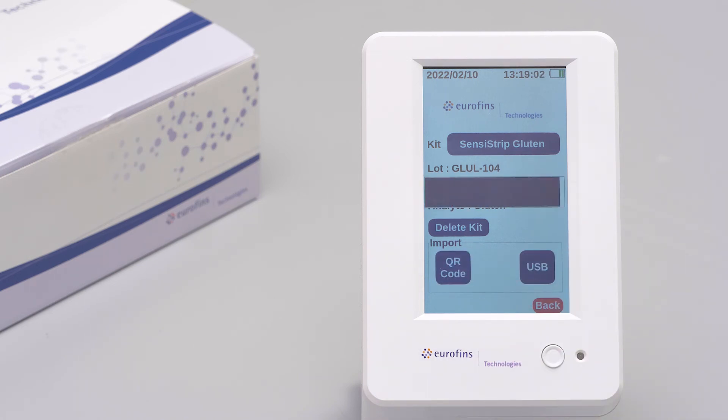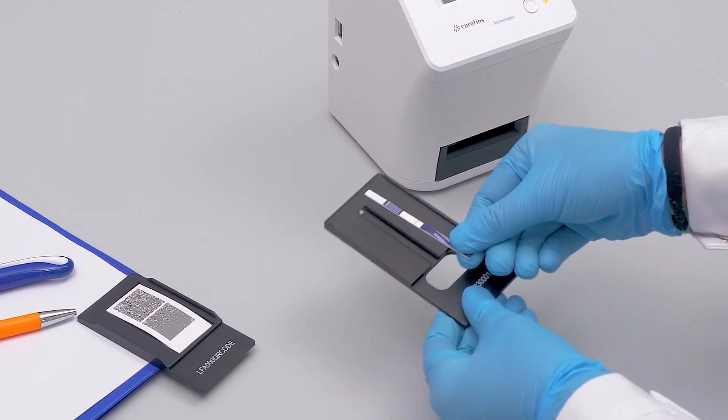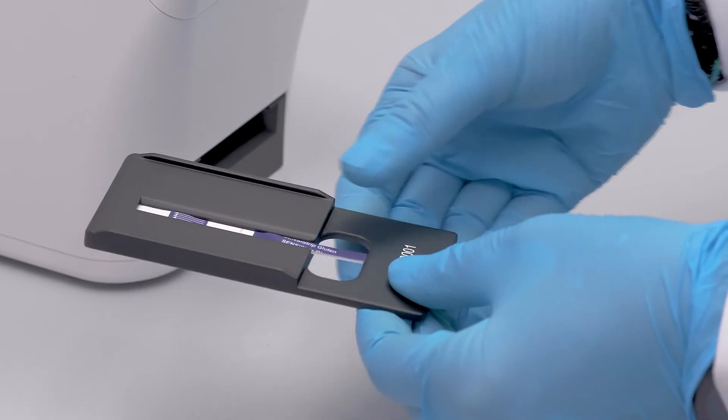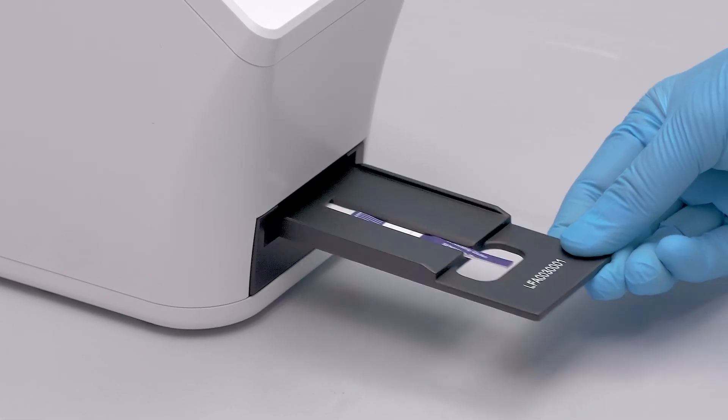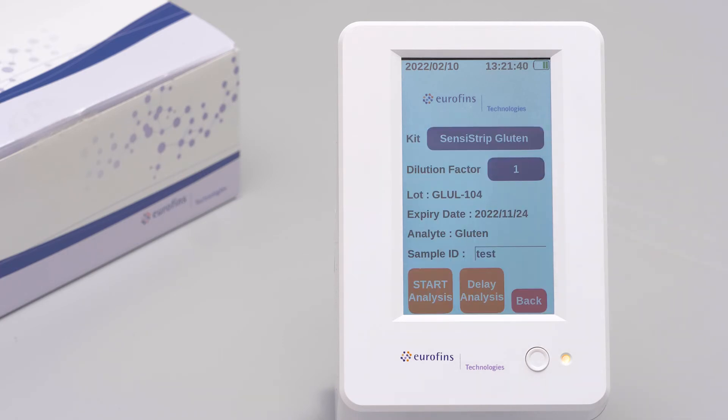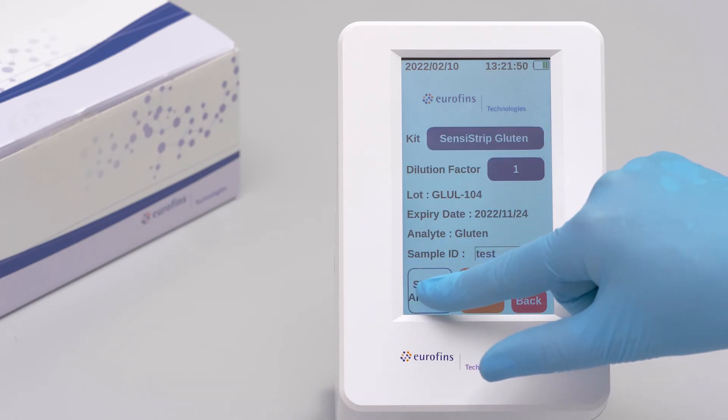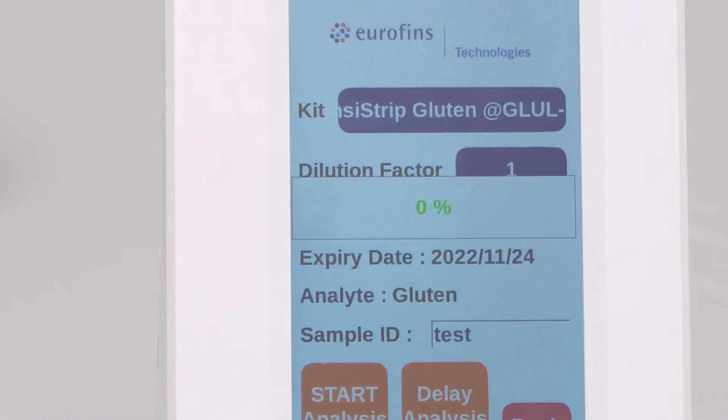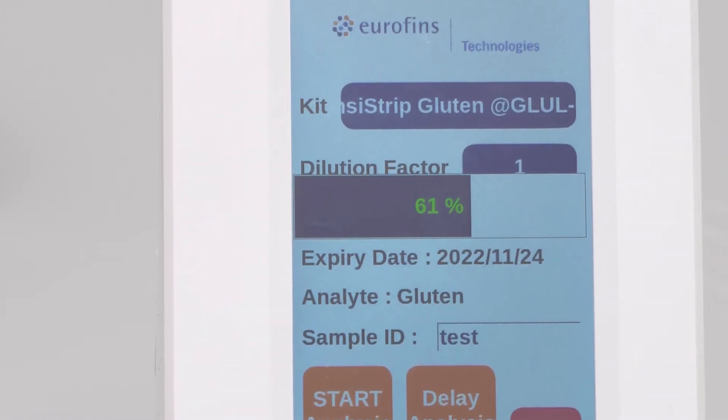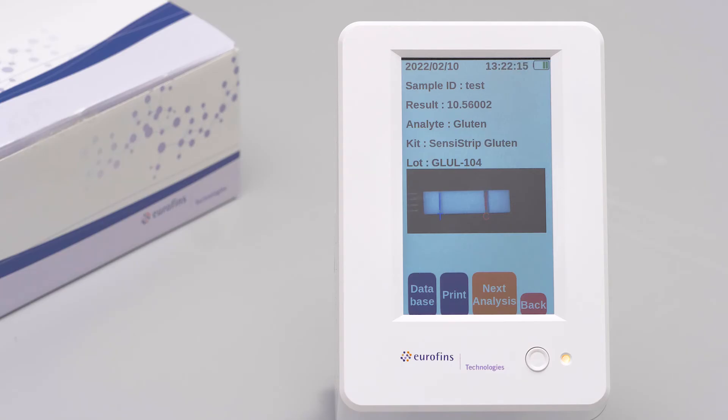Select the test type, the dilution factor applied, and the sample name. Then proceed with the analysis by pressing the start analysis command. The reader will return a quantitative result which can be exported by using the reader's USB port to a computer.